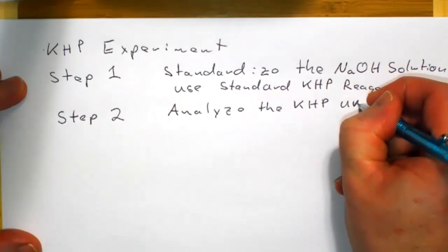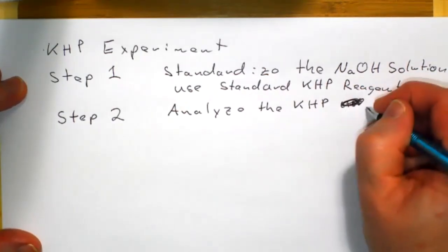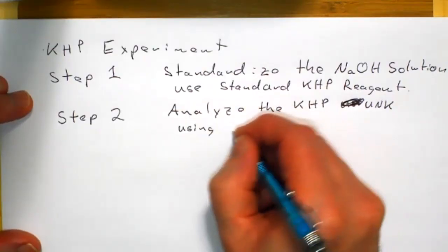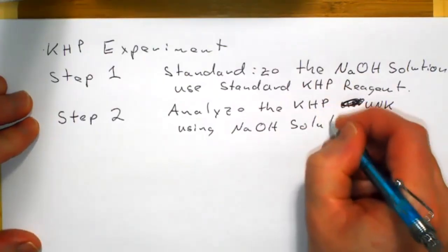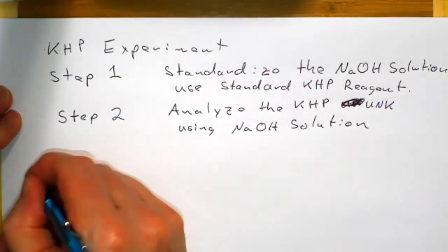We're going to analyze the KHP, that's an unknown, using the same sodium hydroxide solution.